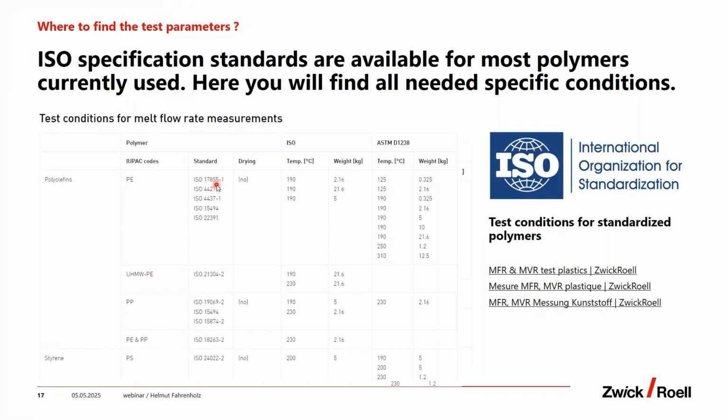As you need to find this specification standard, there is a certain site on our internet website where you are able to find such a table, and you can find out according to which standard you have which testing conditions.